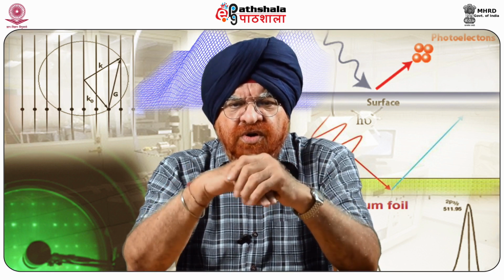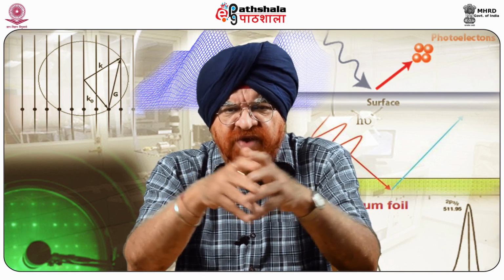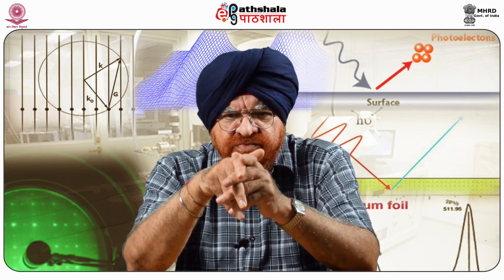In this scheme, the vertical displacement due to normal forces and the lateral twist due to friction of the cantilever are measured using a quadrant photodiode. Force values are calculated from the nominal displacement Δz or tilt angle theta of the cantilever from its resting position.